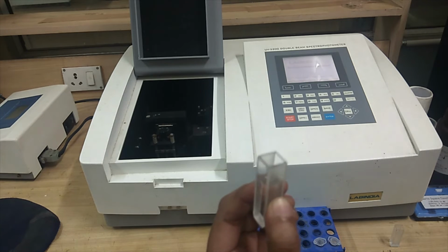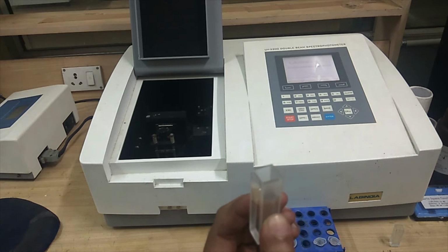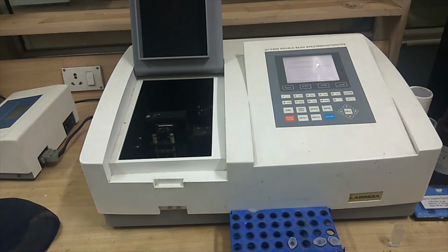However, if you are using a plastic cuvette, it is advisable not to use it during a UV scan. We will do the scanning at 595, so either quartz or plastic will work fine for us.